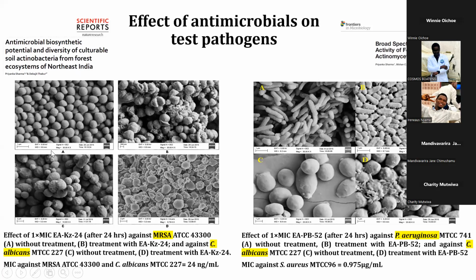When I incubated these cells with my extract for 24 hours, you can see that there is a change in the morphology. There is breakage and shrinkage of the cells even here. So I can say that my extract has antimicrobial substances.